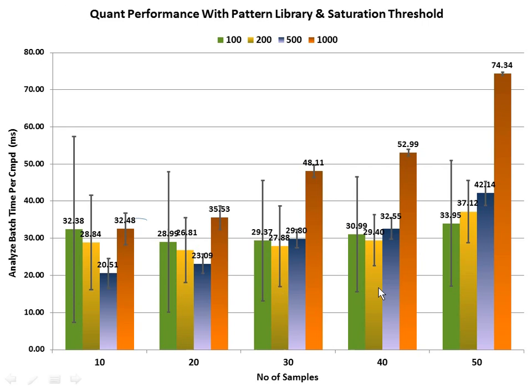Now the amount of influence, if we go to the larger size, let's look at the 50 samples in the 1,000, you can see that the caching effect doesn't play as big a role, and that's because the data is much bigger in terms of keeping all that there in memory.